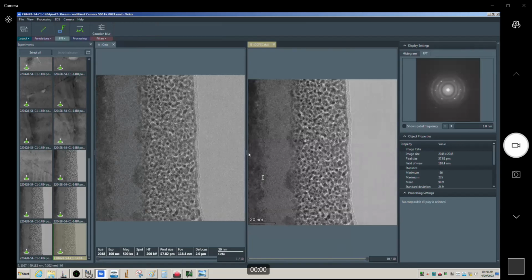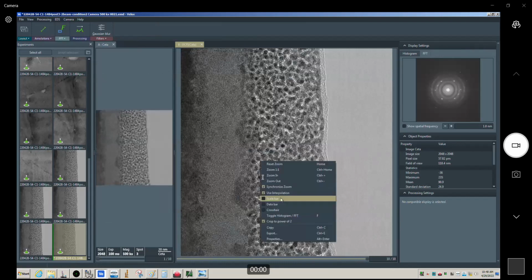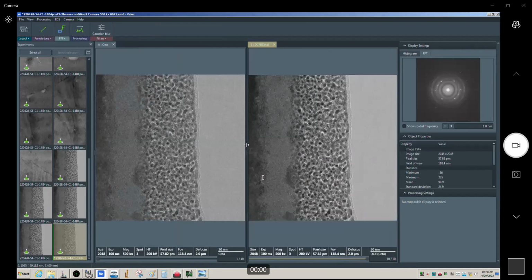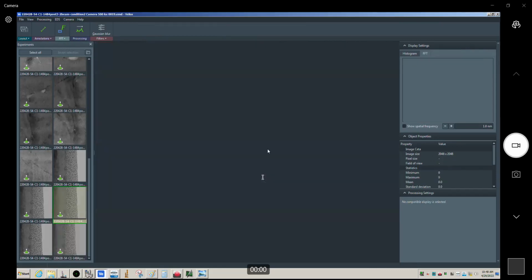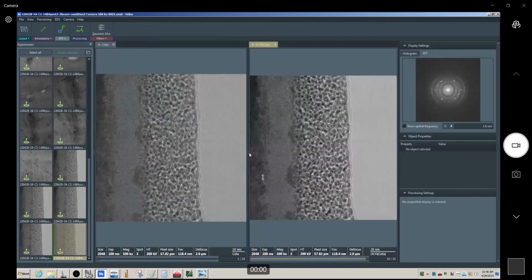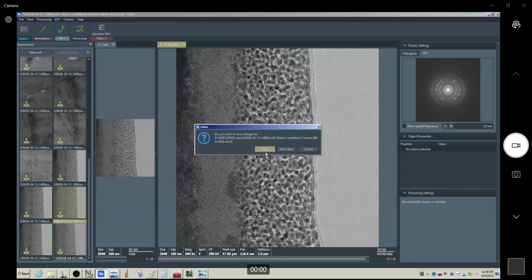Okay, so you can see what it did here. Right, so now you can see the frame combined image looks much better, and it looks closer to what we would have gotten from 1 second, 1 frame. But now the advantage of this is that the system will account for movement between the frames, okay? Or at least it should be accounting for movement between the frames.